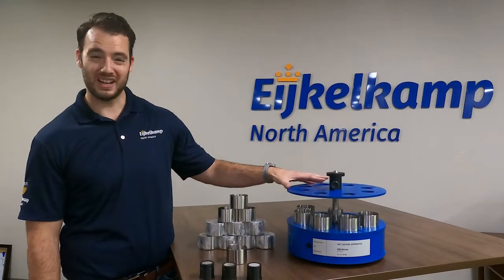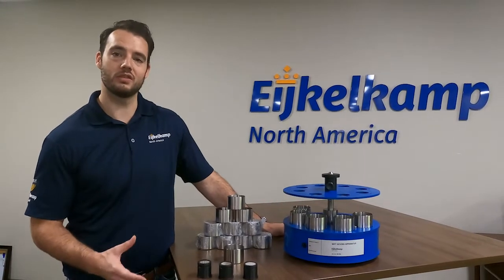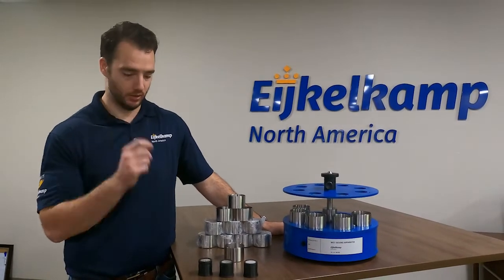This system is great — it's really compact. It's designed to do eight samples simultaneously, so you're going to be able to get through a lot of smaller samples very quickly.